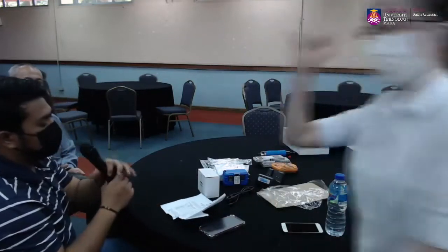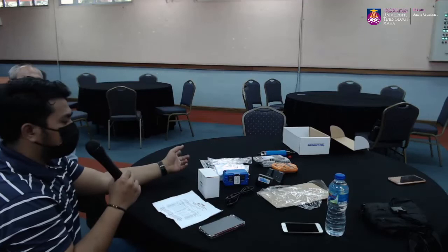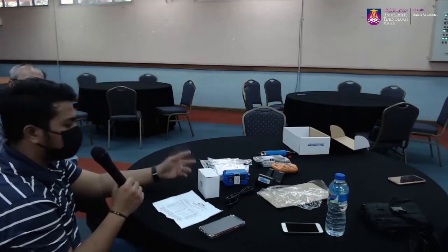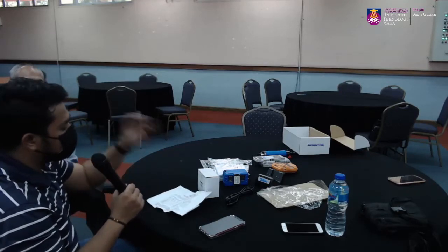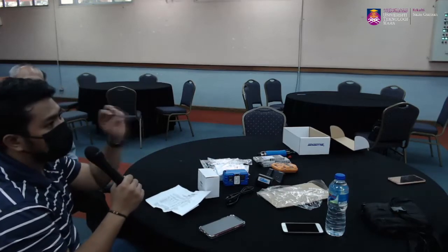Tak perlu calibration. The only thing that needs calibration is the airflow calibrator. Yang airflow calibrator yang sampai tu, dia punya flow cell tu needs to be sent annually lah. So that part tu, itu sahaja yang nak kena send. So air sampling pump ni, once you purchase, you don't need to send it for calibration. It's just in terms of your own servicing, ataupun you nak hantar kita untuk service and maintenance pun tak ada masalah.